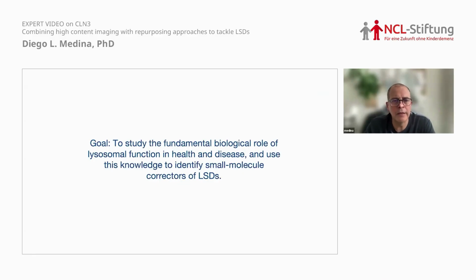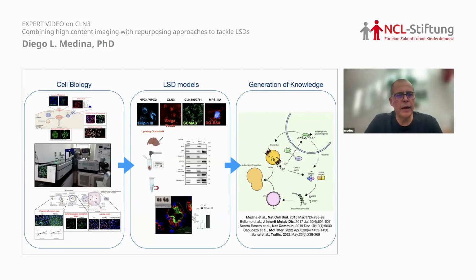Basically, the major goal of my laboratory is to study the fundamental biological role of lysosomal function in health and disease conditions, and use this knowledge to identify small molecule correctors of lysosomal storage disorders. In this slide, I try to explain our modus operandi.